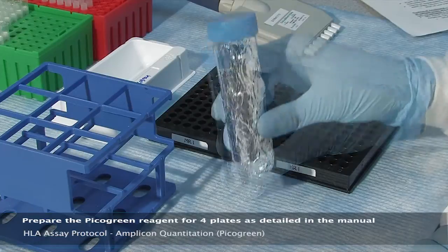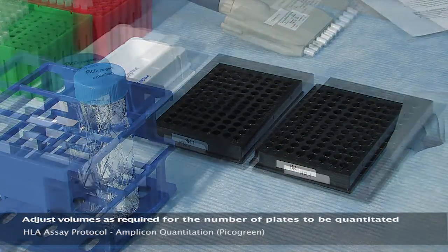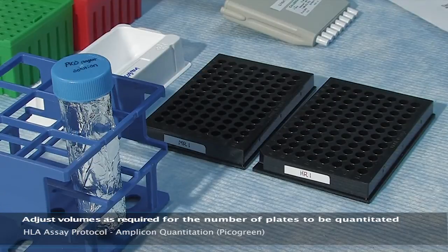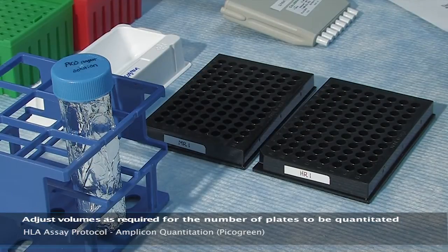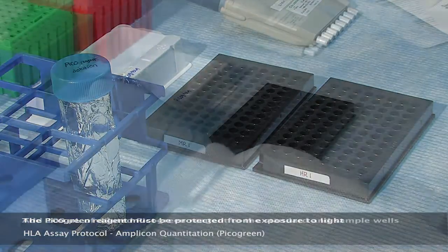Prepare the PicoGreen reagent as detailed in the manual for four plates, and note that volumes may be adjusted for the number of plates to be quantitated. The reagent must be protected from light, so be certain to wrap the working reagent tube in foil or keep the tube in total darkness.